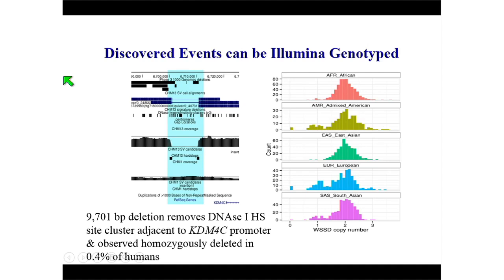So I'm pumped because I think that if we do this systematically, long-read sequencing of human genomes, we can fill out at least the spectrum of genetic variation between two base pairs to, let's say, 20 to 30 kilobases, the normal pattern. And we can understand, at least for common variants, the sequence structure of those, and then go back to our patients to find potentially disease risk or disease-causing loci.